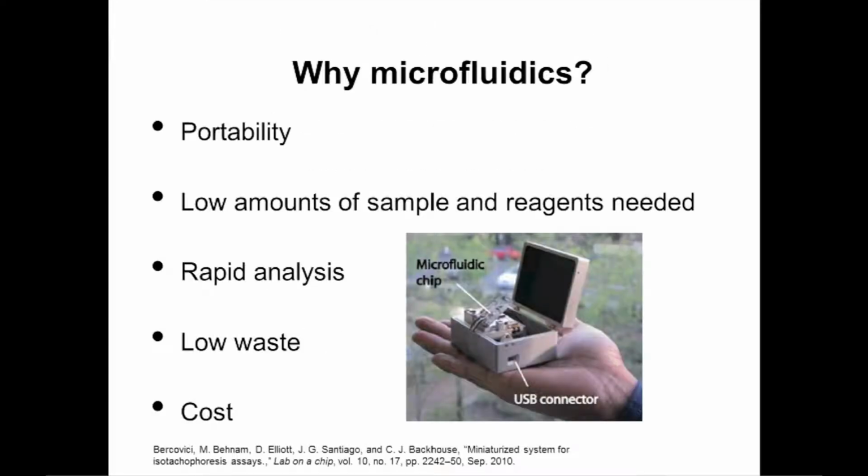Why microfluidics? First of all, portability. We can build microfluidic devices that fit in the palm of your hand, and because of the small size, we can use low amounts of sample and reagents, which lead to low waste and reduced cost. Also, microfluidic devices can perform rapid analysis of samples.